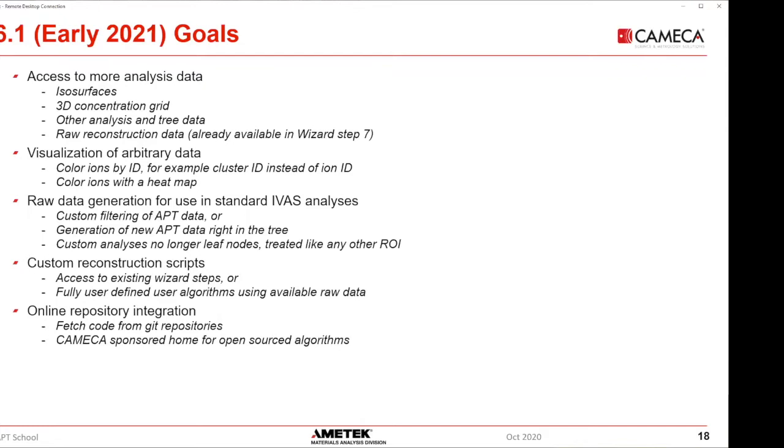or through export things. So for instance, you can export isosurfaces in, I'm forgetting the exact format we're using for that, but it's an industry standard mesh format, as opposed to trying to... STL, is that what we said?